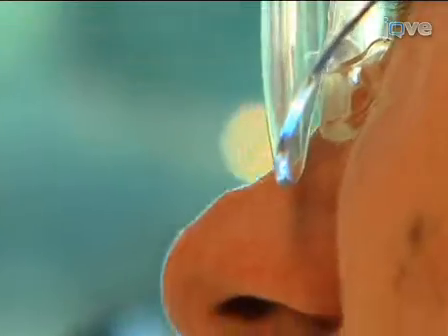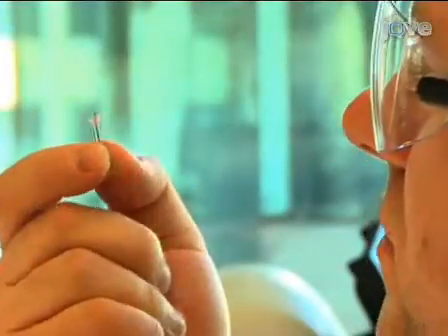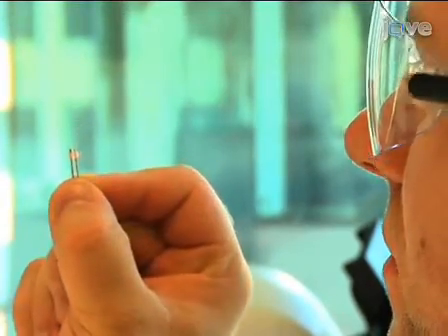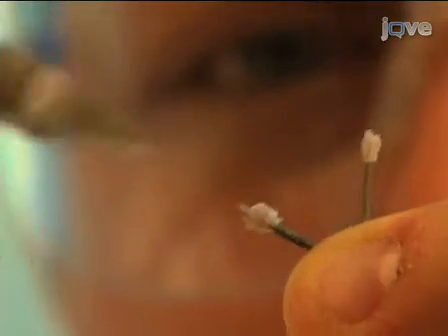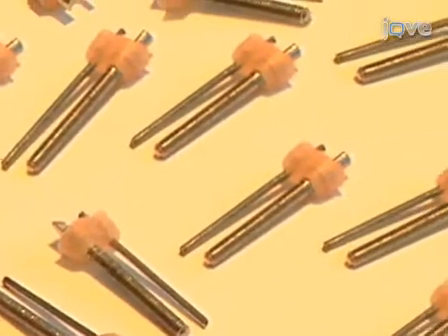Do a strict quality check. There should be no cracks or bubbles in the acrylic. The post and screw should be parallel and unable to move sideways. The screw should turn smoothly but with no play. Any bad microdrives should be broken down and the parts reused. Repeat this process until you have 21 good microdrives.